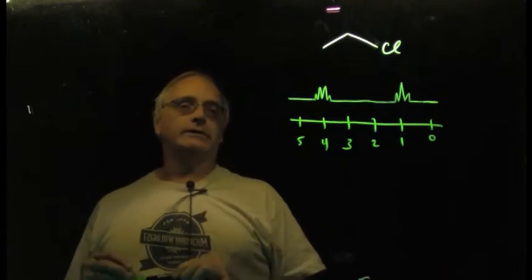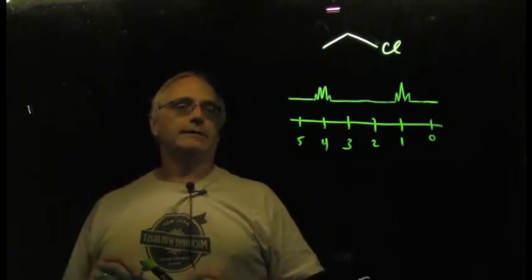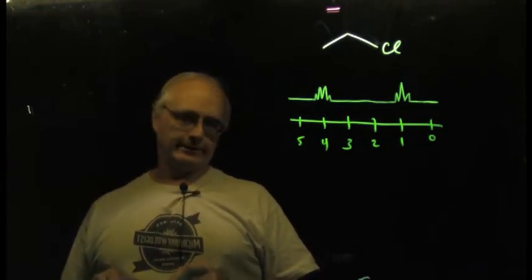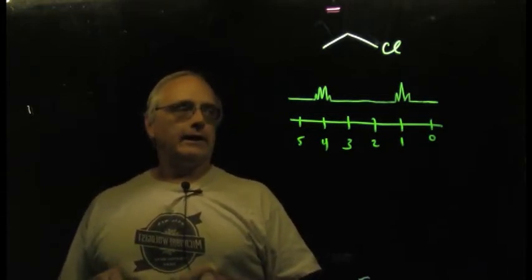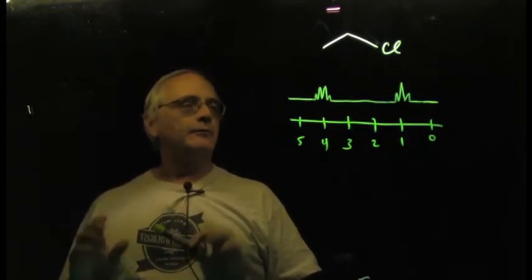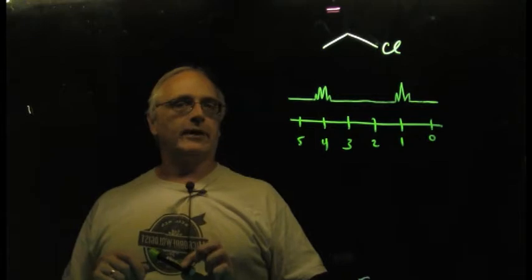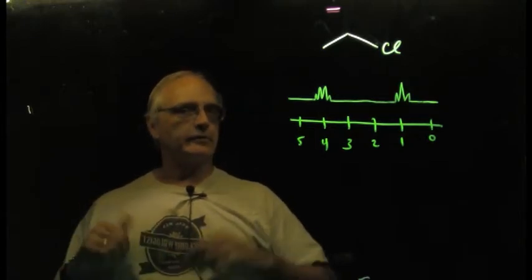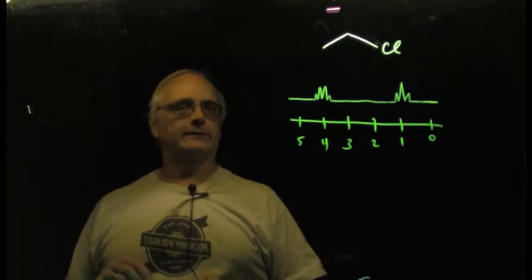Now, integration is a property of proton spectra. We don't do that in carbon-13 NMR spectra typically. And there are very good reasons for it, and yes, we'll talk about that too. But for right now, integrated spectra is almost exclusively referring to, for our purposes, proton NMR spectra.